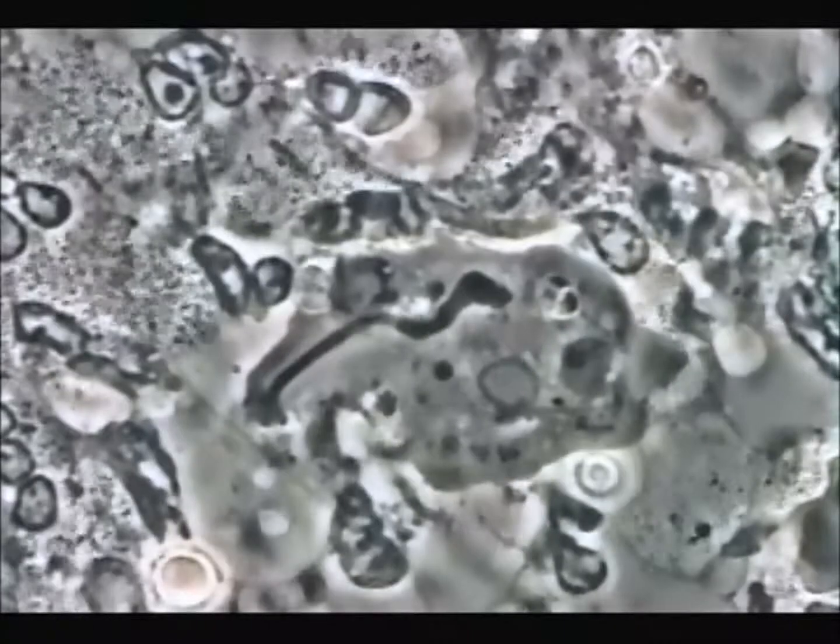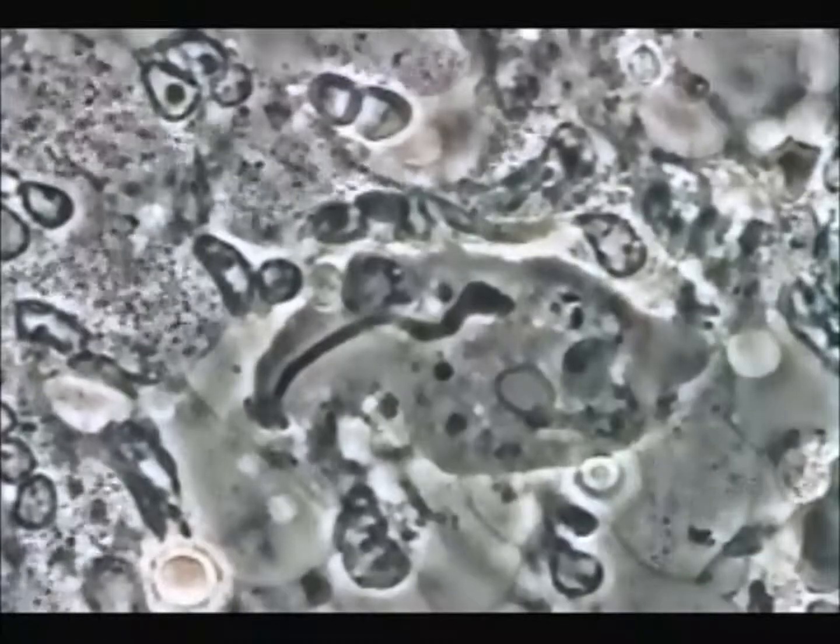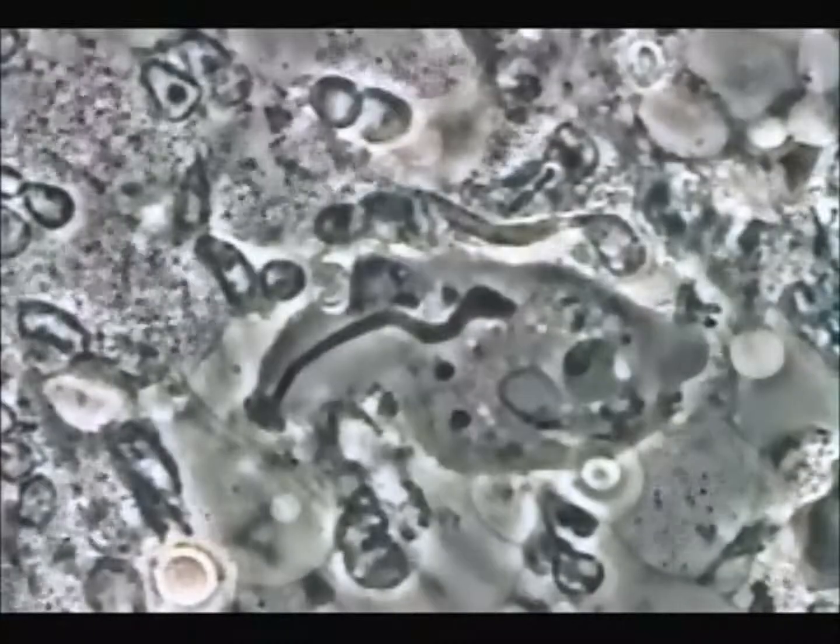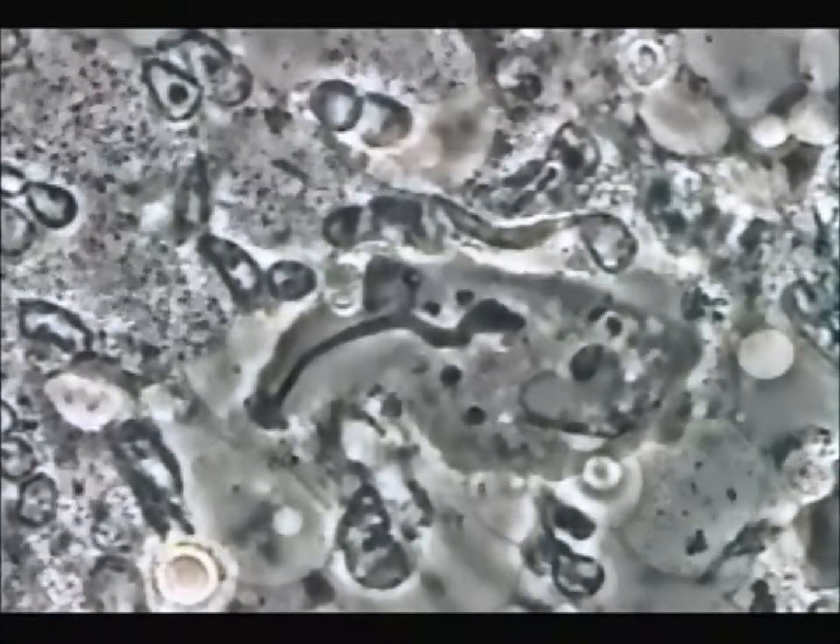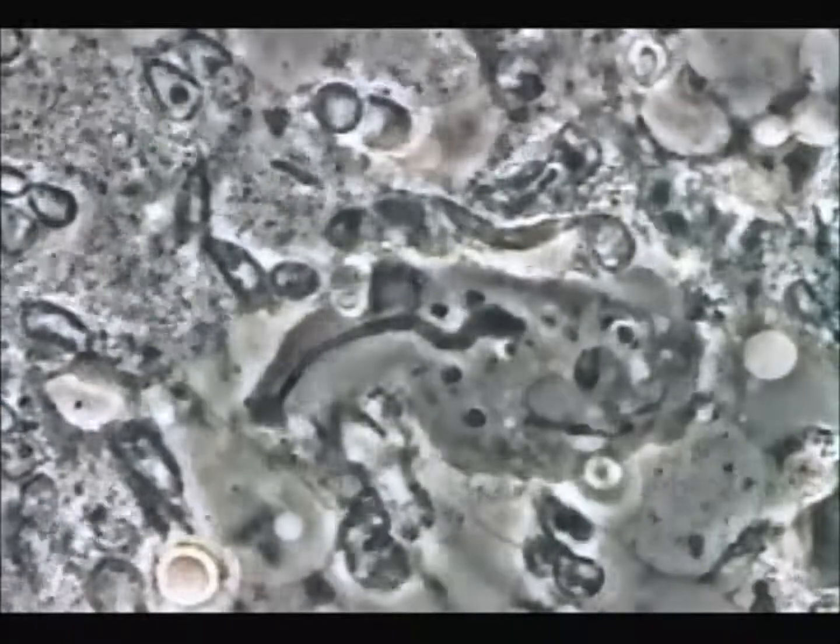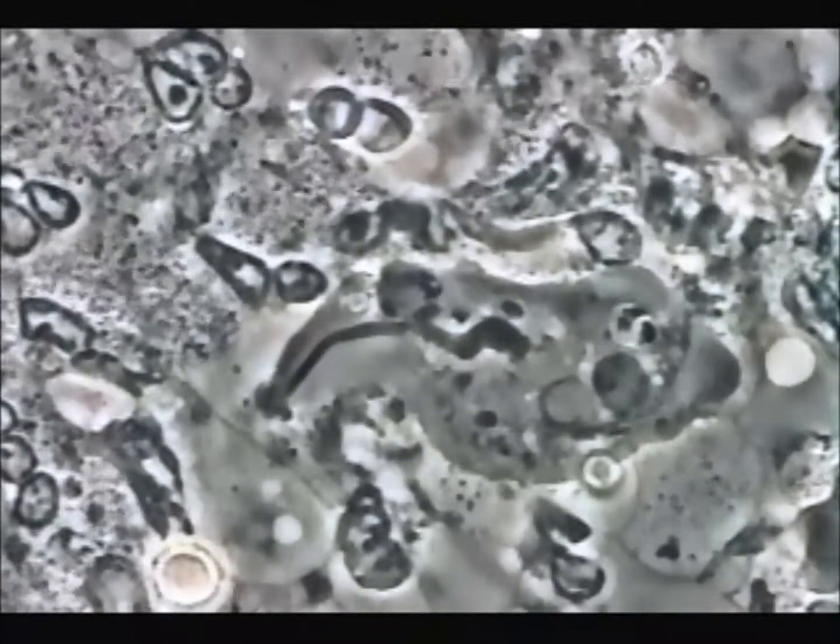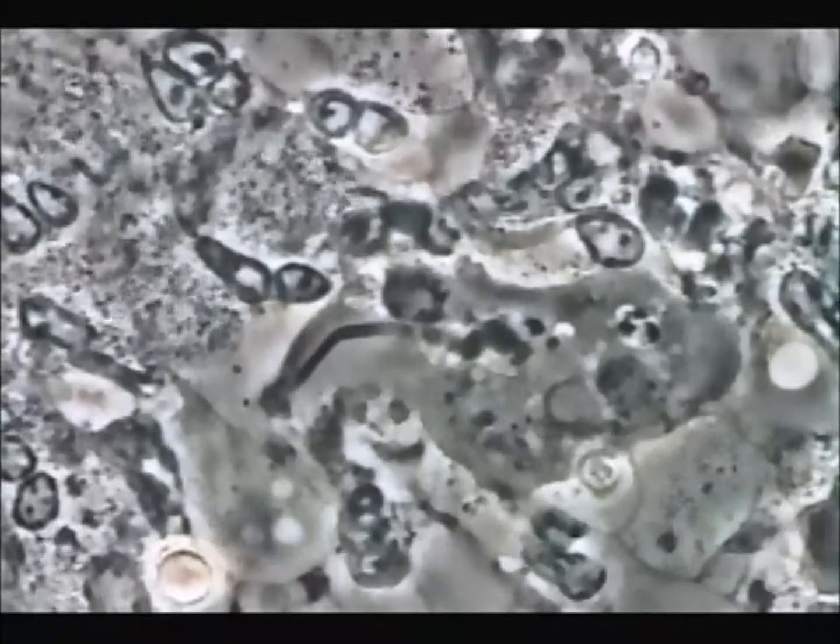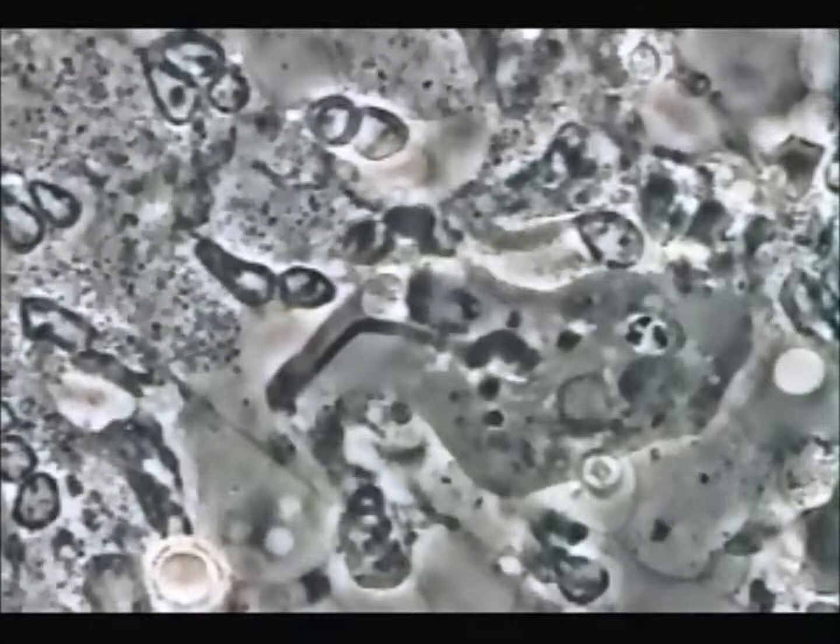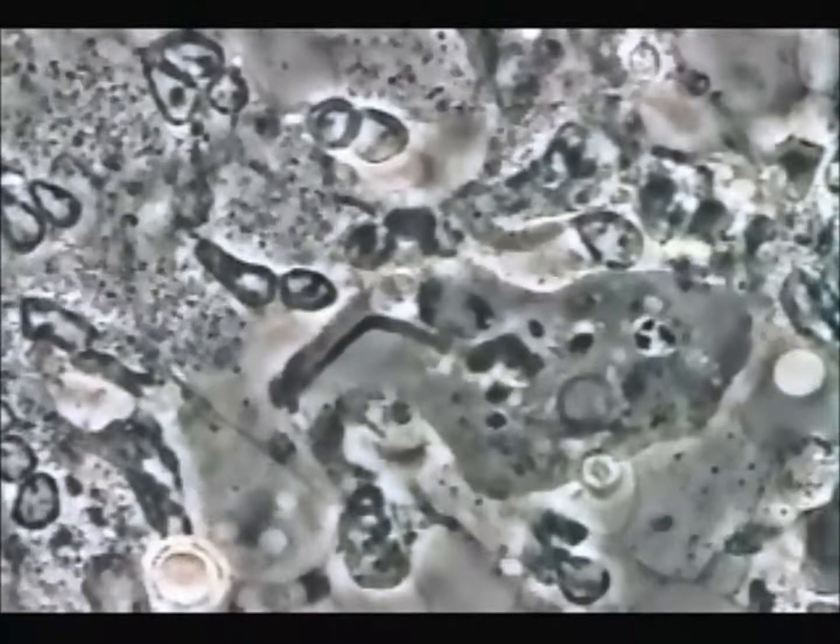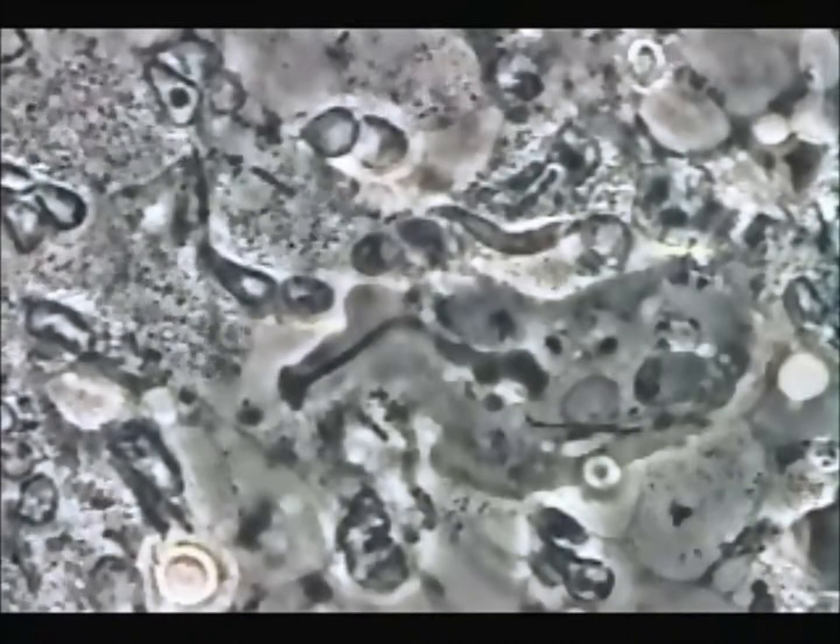The amoeba in the center with the nucleus has a little pseudopod going on at the right, and you see mostly the pseudopods with the suction of the nucleus of the white cell. Progressively the trilobe nucleus will be inside the amoeba with exonucleophagy. This is a phagocytosis of the nucleus of the white cell.